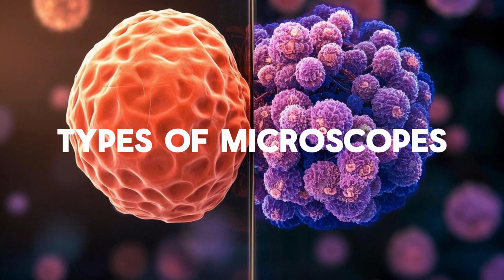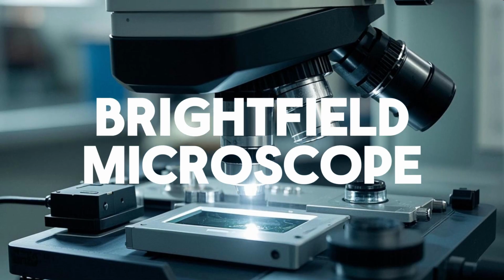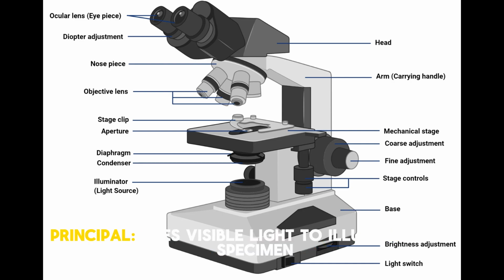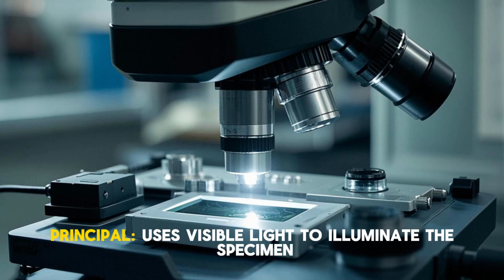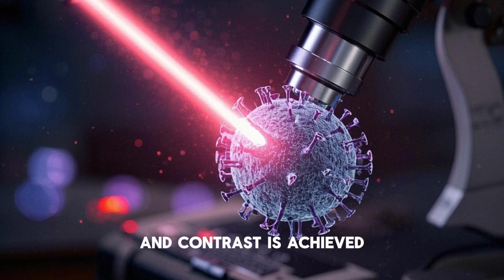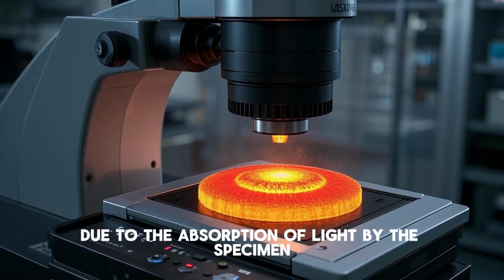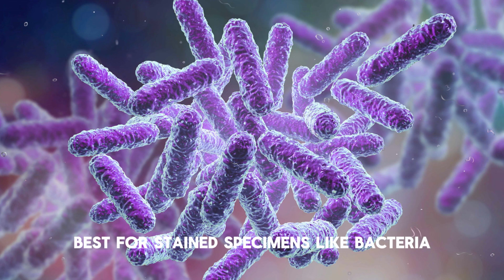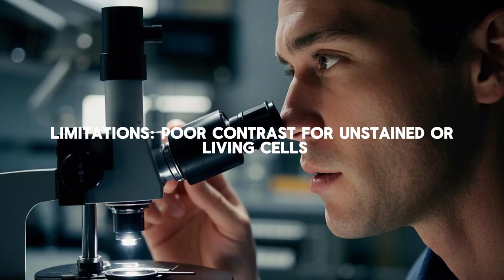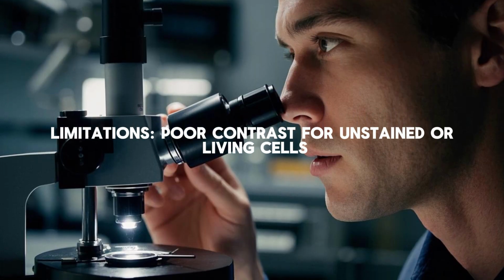Types of microscopes. First, we have the bright field microscope, the most common and widely used microscope in labs. Principle: uses visible light to illuminate the specimen. The light passes through the specimen, and contrast is achieved due to the absorption of light by the specimen. Best for stained specimens like bacteria, fungi, and tissues. Limitations: poor contrast for unstained or living cells.